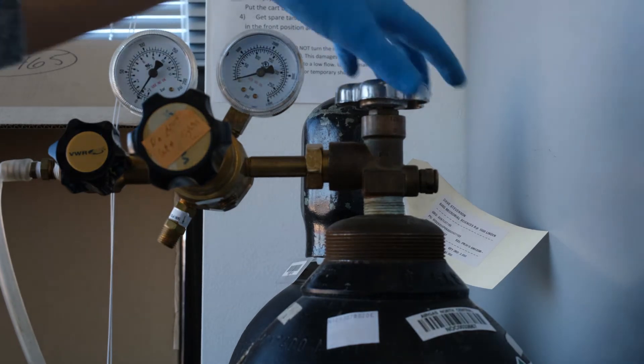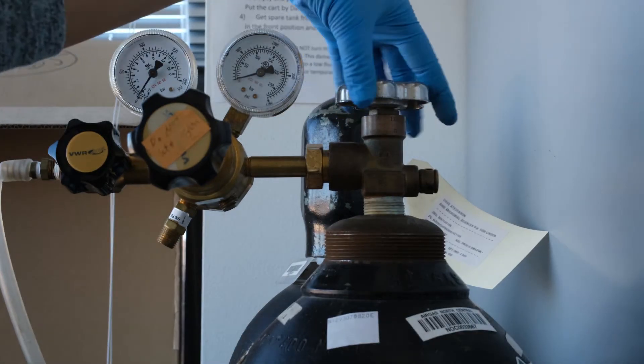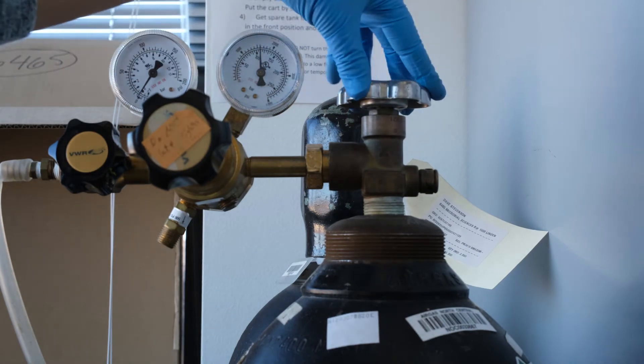Open the nitrogen tank completely by turning the knob to the left. You will see the pressure gauge respond when the tank is open.